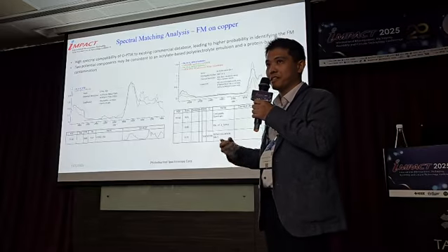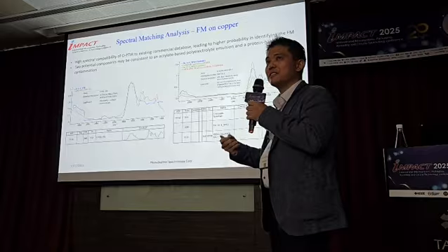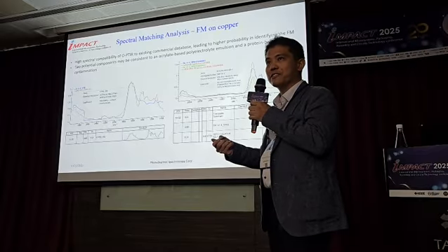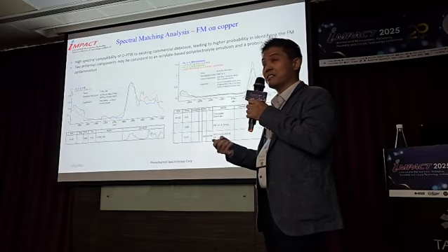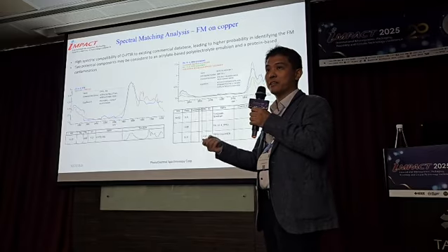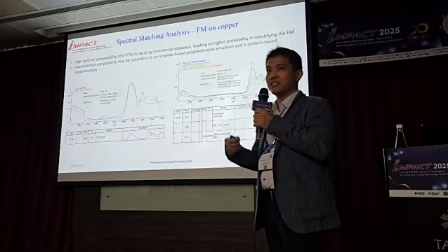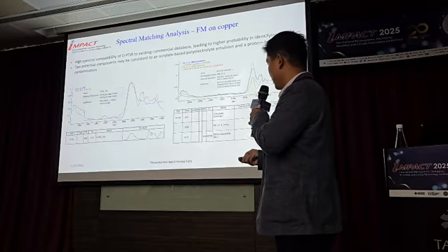So by using a technique like the Mirage O-PTIR, we can identify contamination with a dimension of less than 2 microns. This is not something we could have done in the past, because of the lack of spatial resolution and sensitivity. But it's something we can now do with submicron IR.